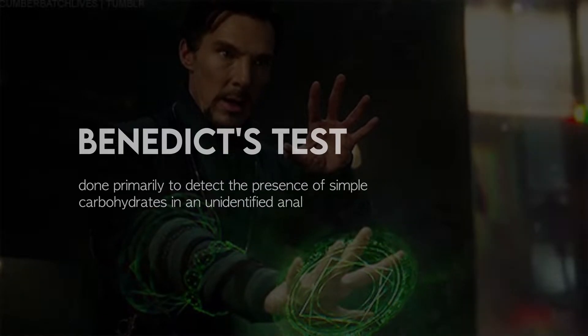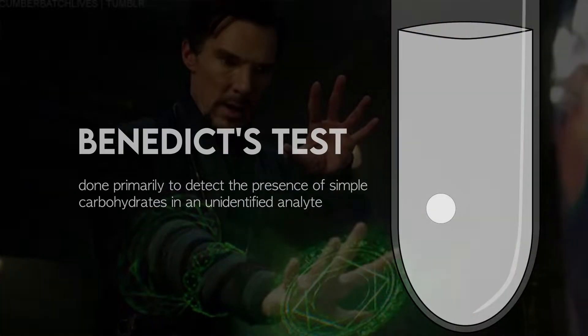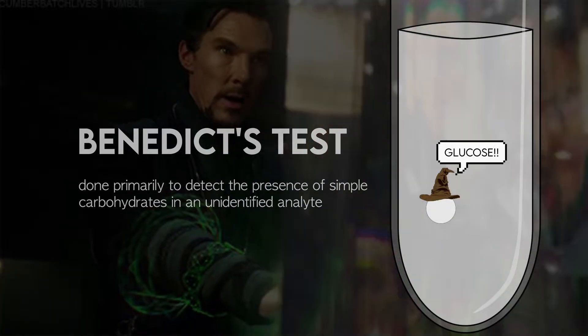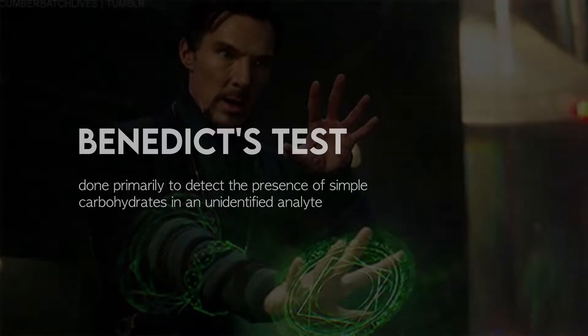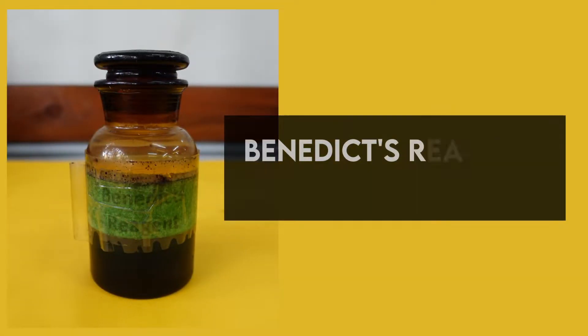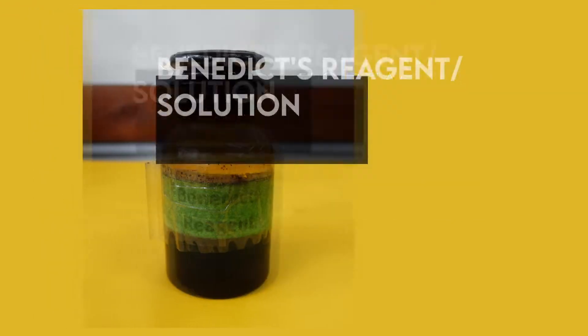A Benedict's test is done primarily to detect the presence of simple carbohydrates in an unidentified analyte. In this test, a Benedict's solution is used.